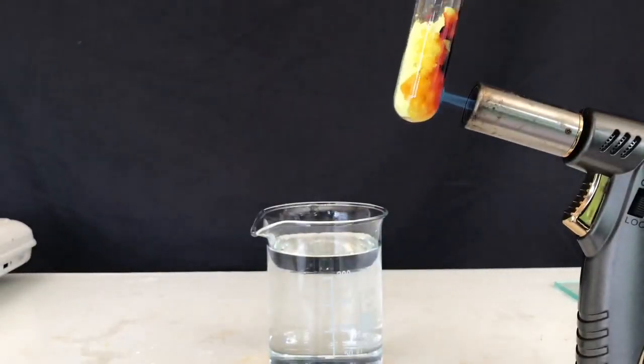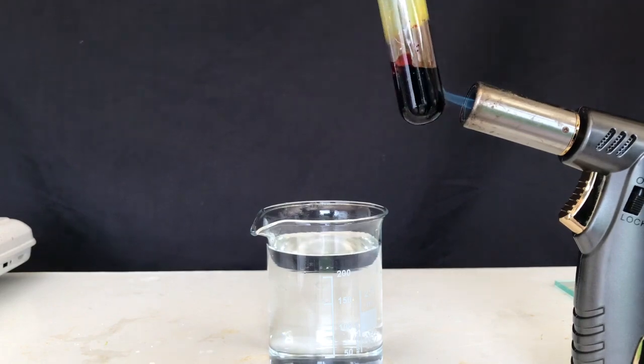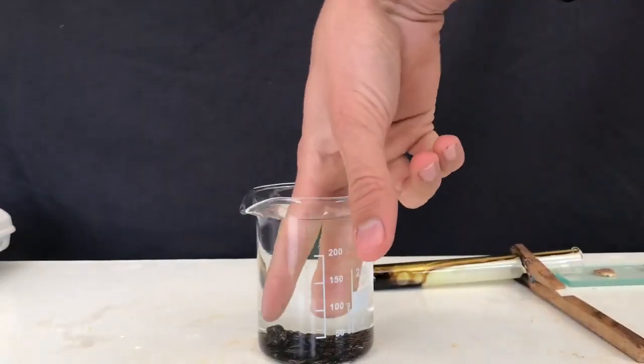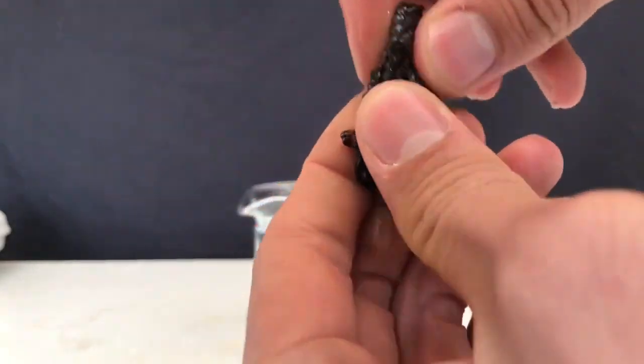When you heat up the sulfur pretty strongly, at some point you are going to get a red goo. When this stuff is poured into water, mu sulfur, also known as plastic sulfur, is obtained. This plastic sulfur behaves a bit like rubber and you can bend and manipulate it.